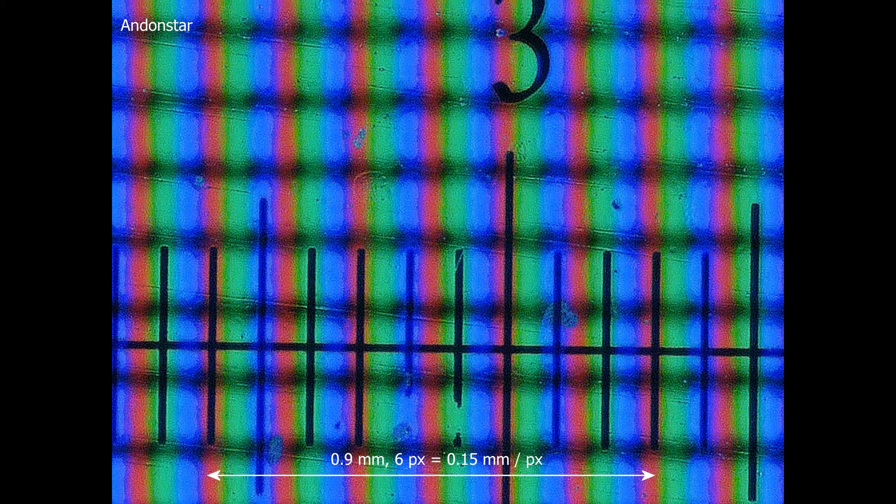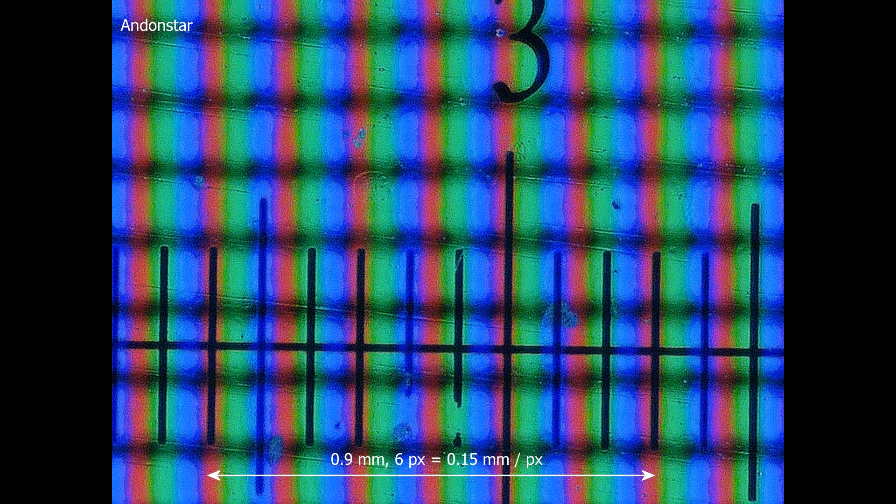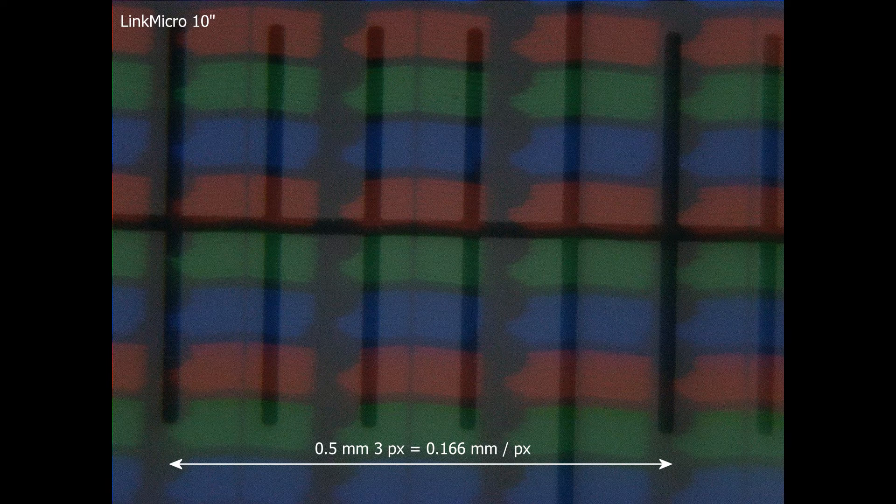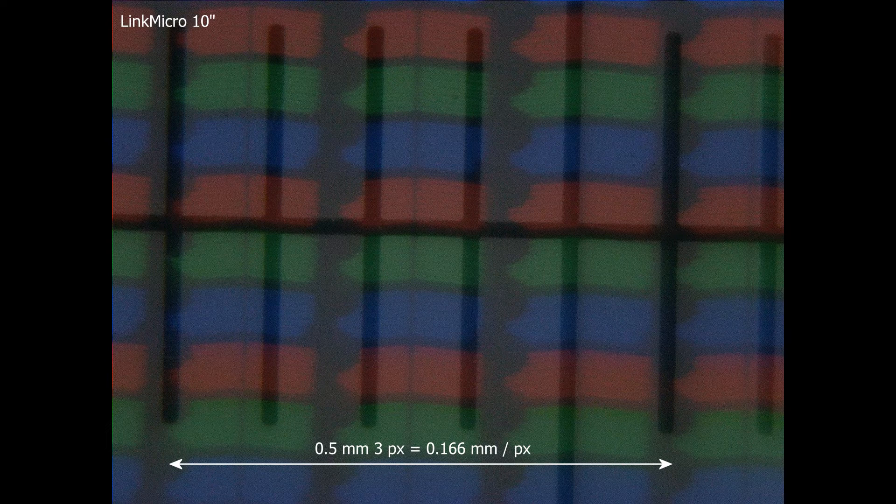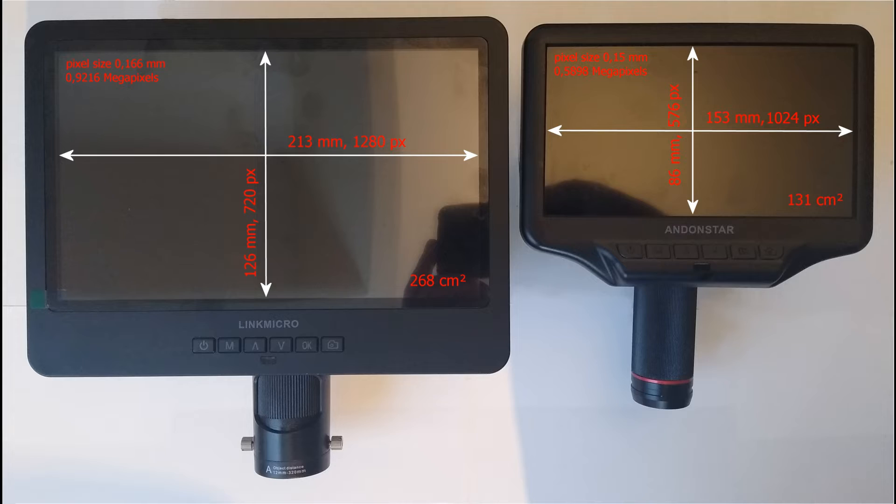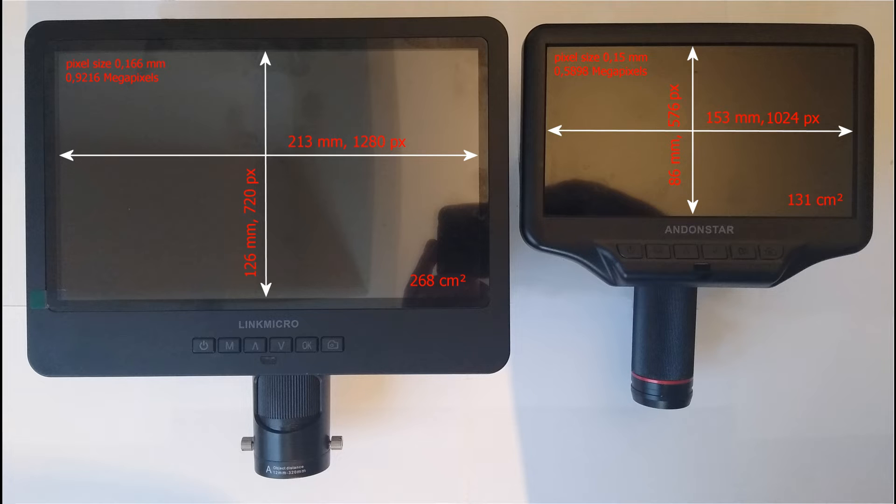Let's take a closer look at the LinkMicro's display. The surface area is more than twice that of the Andonstar, but because the pixels are larger, the increase in pixel count is limited to 56%. As previously noted, the camera is exactly the same as in the Andonstar and has a 4MP chip, so here too the 0.9MP screen can zoom in twice without loss of detail.